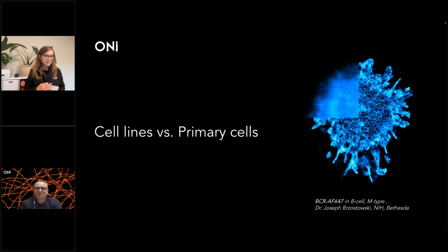Yes, and I believe we have some more guidance for anyone who's interested in the handout section, where we have some fluorophores for your reference. And what about the wells in which I have to seed or add my cells? What do I need to watch out for? What wells can I use?